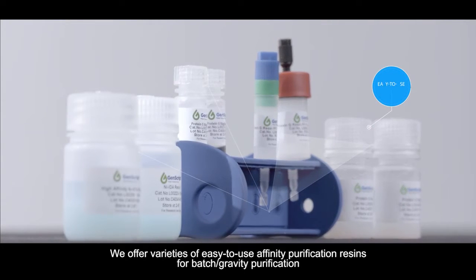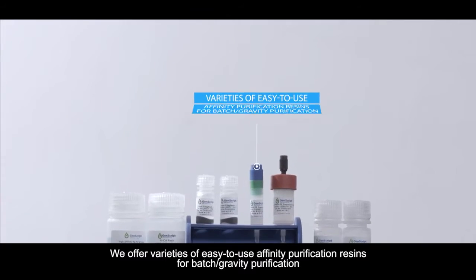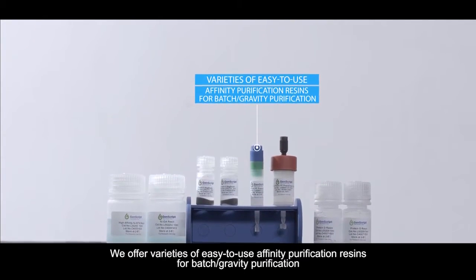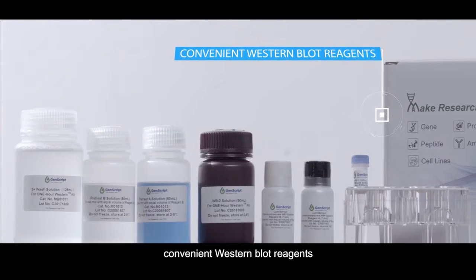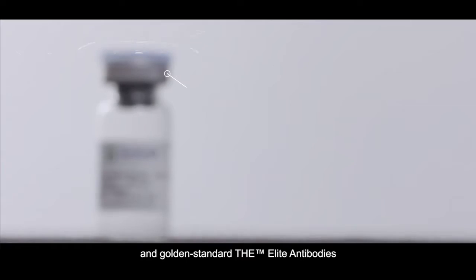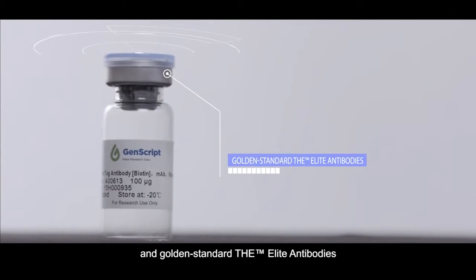We offer varieties of easy-to-use affinity purification resins for batch and gravity purification, high-quality precast page gels, convenient Western blot reagents, and golden standard Elite antibodies.